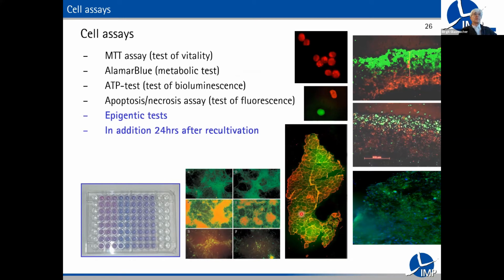Here we did an apoptotic cell assay. So the orange parts are apoptotic cells, and this is a frozen kidney, and we sliced it with the microtome, and we looked at the slices, and we looked how the cell survival is, and we are happy that we have green areas here, unfortunately not in all depths, and this is due to heat and mass transfer, which was not 100% optimal, because in the optimal case, enough cryoprotectant would have been diffused into the middle of the tissue, and also the release of energy would have been more homogeneous. So this is in direction of tissue engineering and organ preservation to get this information.